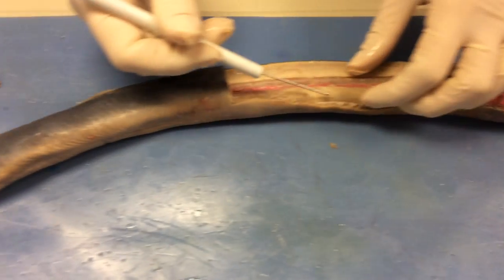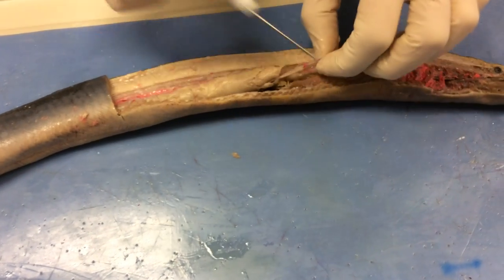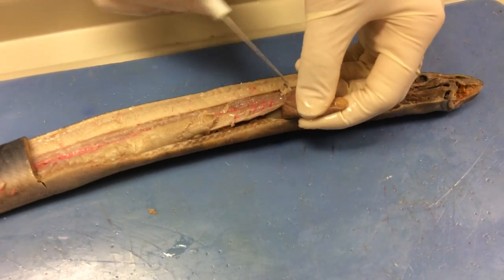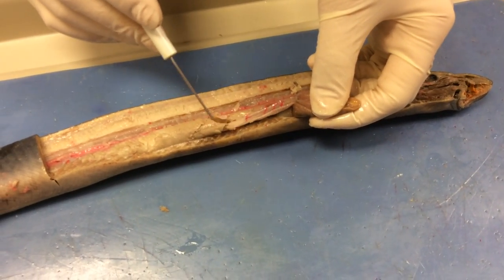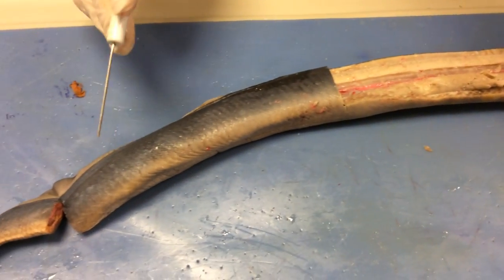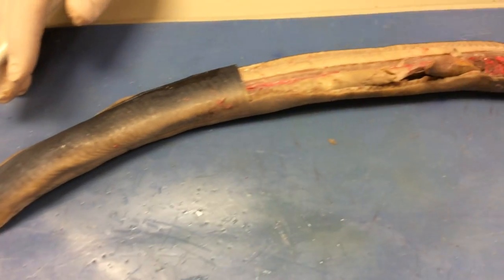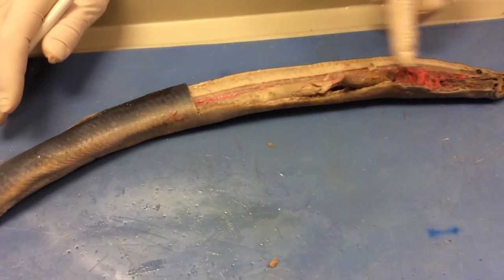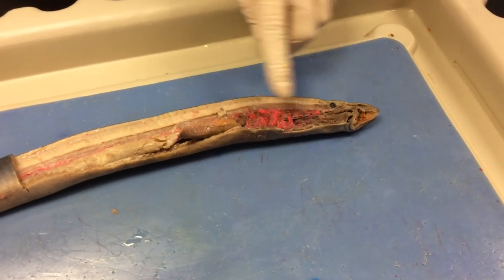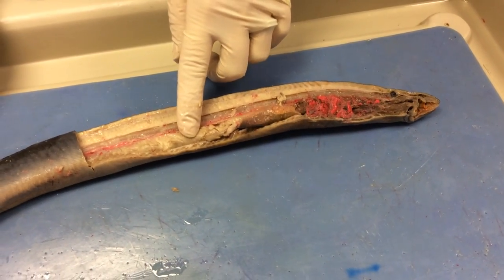And then if we remove some of these eggs, we should find a tube that runs inside. This tube essentially is connected, you can see it off of the liver, to the esophagus and is going to run all the way down to the cloaca. And this is the intestines, where the absorption of the nutrients happens. Remember that these organisms, since they're drinking blood, do not need a stomach to do mechanical digestion, so it goes straight from the esophagus directly into the intestines for absorption.